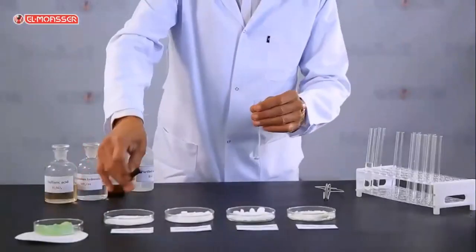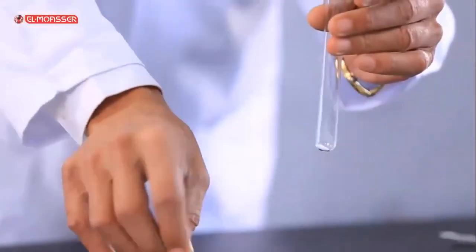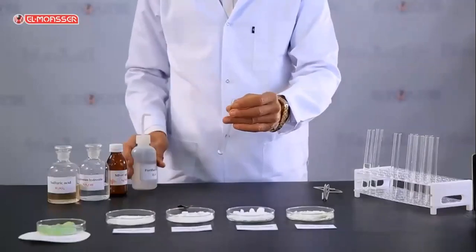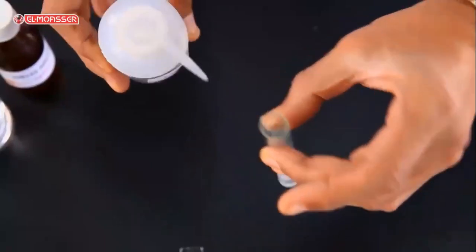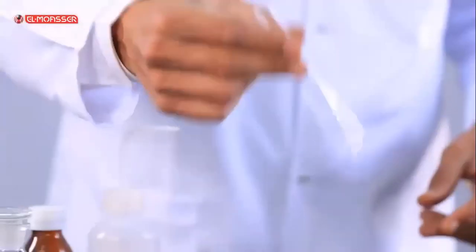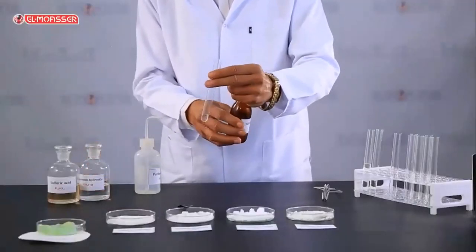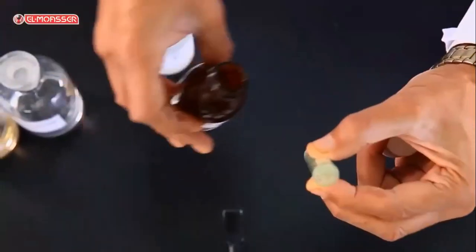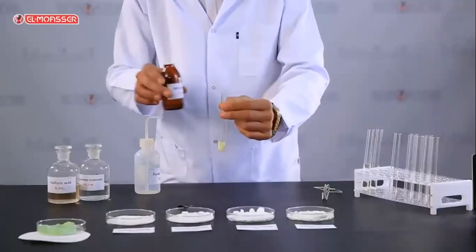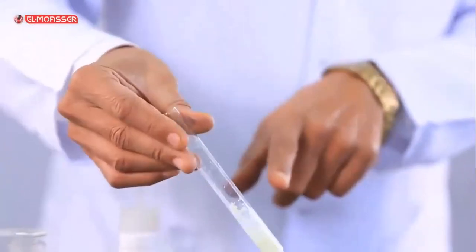Confirmatory experiment. Add a small amount of sodium bromide salt to a clean test tube, then add distilled water with shaking to form a salt solution. Then add to it silver nitrate solution. What do you observe? A white yellowish precipitate of silver bromide is formed.